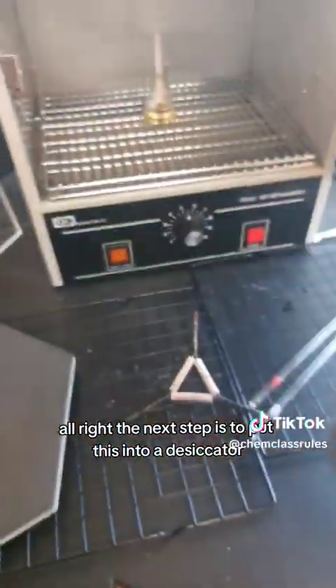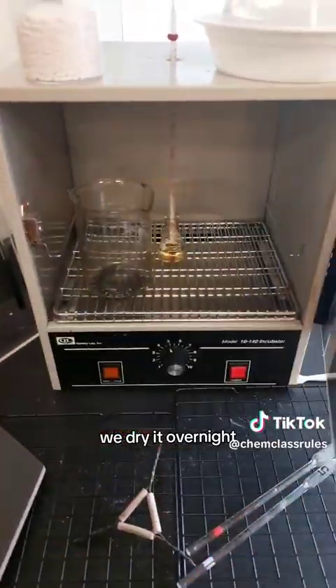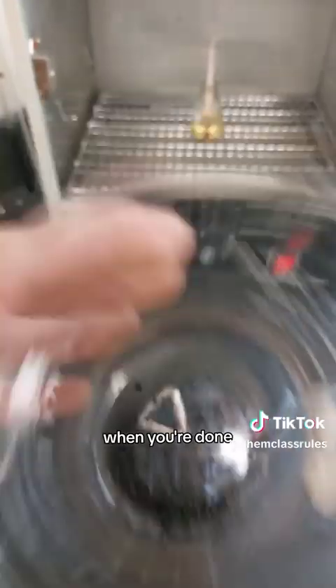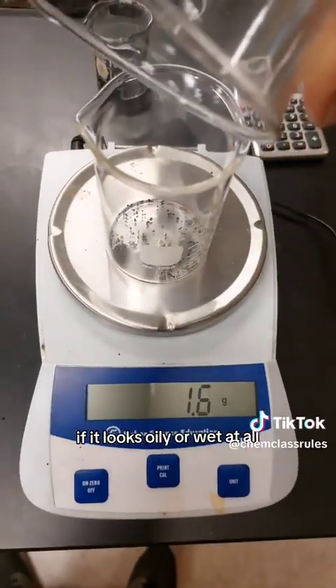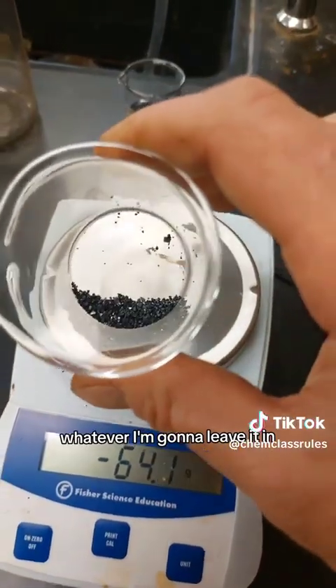The next step is to put this into a desiccator — we actually use an incubator — and dry it overnight. This drying process is really, really important. It should look like this when you're done. If it looks oily or wet at all, it needs to go back into the desiccator.